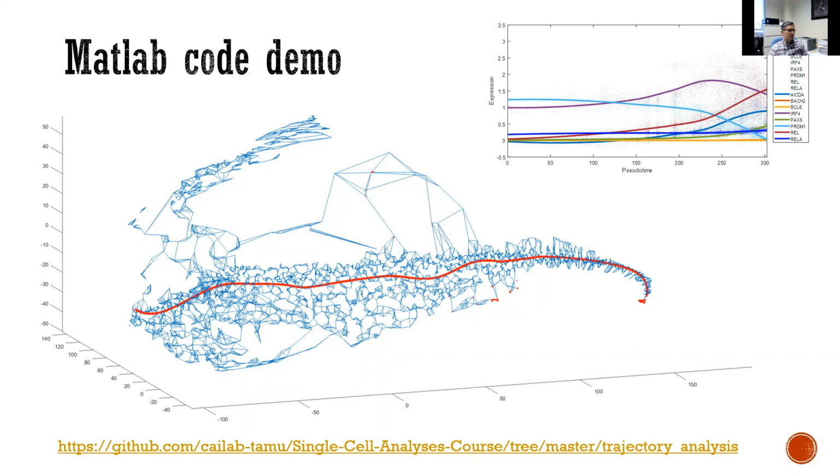So you can go along those links to build a trajectory and use this trajectory as your pseudo-time trajectory, and then it's possible to cover most of the cells and assign the pseudo-time values of the neighbor cells to this trajectory.